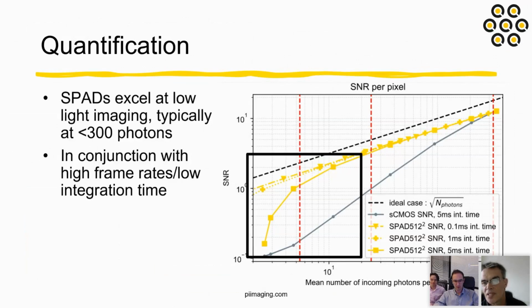Great. And what is the time width of the impulse in tagging mode, and does it vary with count rate? This is 100 picoseconds, and it does not vary with count rate. It does not vary. And in tagging mode, what would you give as a recovery time? The recovery time is limited by the SPAD dead time, so this will be in the range between 10 and 50 nanoseconds, depending on the detector. So for the SPAD Lambda it is more like 10, and for SPAD 23 it is more like 50 nanoseconds.